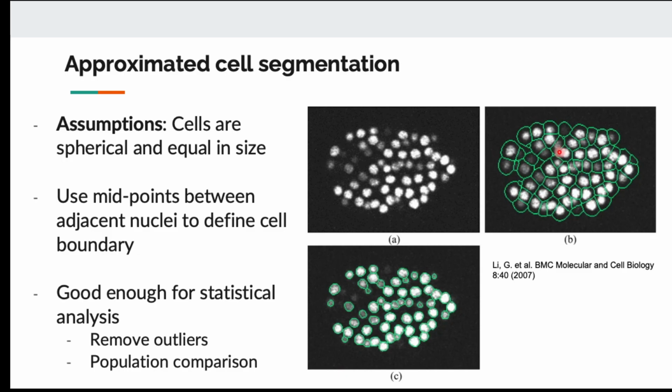So you can imagine that if you start with this image and you expand all the cells outward until they touch each other, you're going to get something like this, like a beehive, where you get the position of the individual cells located. So sometimes in the algorithm, we need to make this kind of assumption to get an approximation of where the cells and the nucleus are.